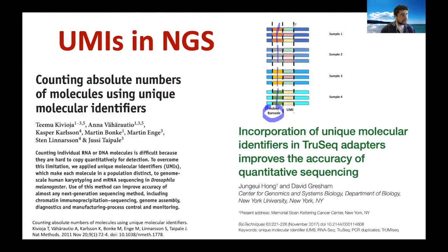The UMI, sorry, my bad. As you can see, they're all different. You have green, red, yellow, green, red, red, green, red, green, yellow, yellow, yellow. They are just tagging individual molecules.